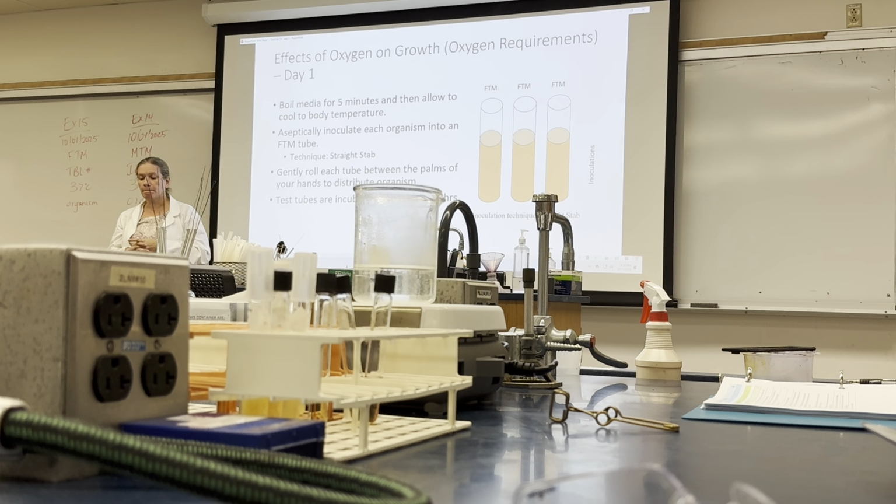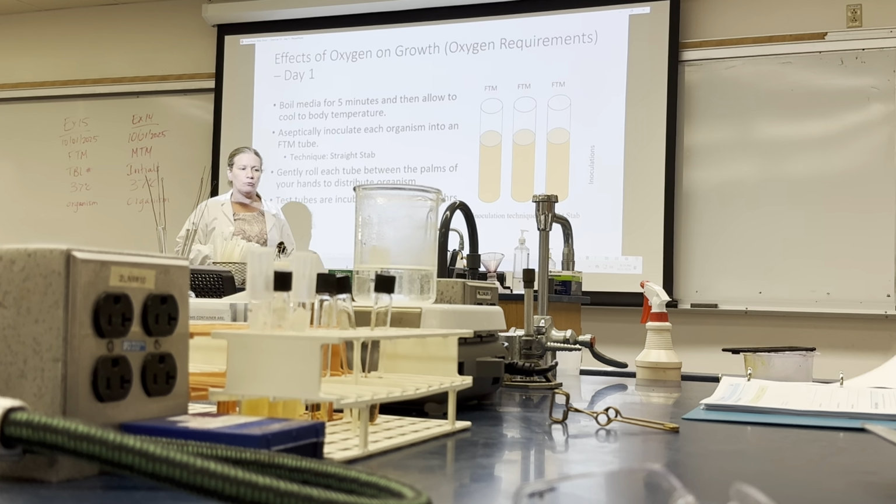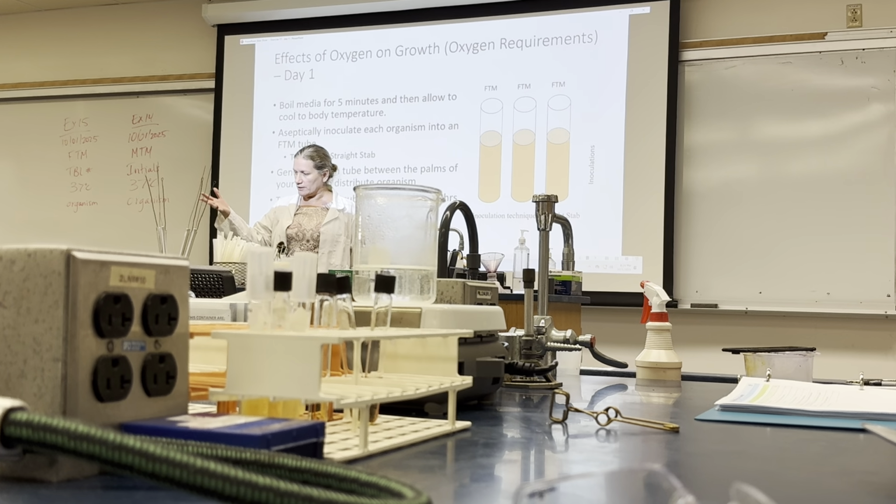Okay, all right, those are probably already cool, so this is going to take all of about 3 or 4 minutes. Done. Motility test medium, 3 or 4 minutes to inoculate. The longest thing it's going to take you is probably looking at the wet mount. You guys can go ahead and start.